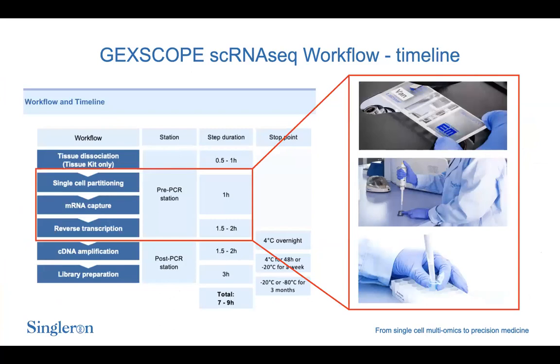So how does the single-cell RNA-seq workflow actually look like?